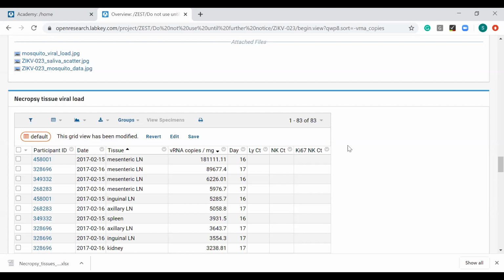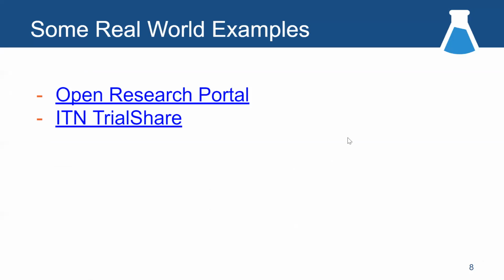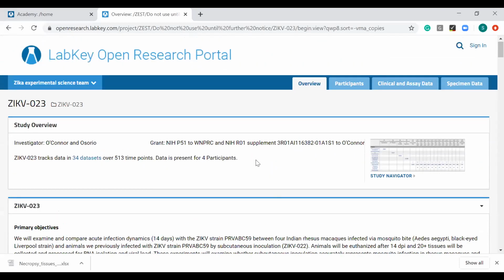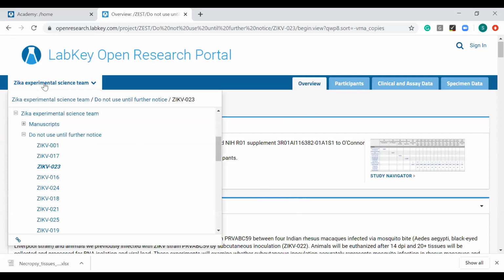There's nothing else, so I'm just going to keep going. There's lots to see here. So this is your basic introduction to the LabKey UI. There are tabs or dashboards that you can configure. There are panels that you can surface to provide different presentations and analyses of the data. And there's also this menu over here. This is the folder menu.